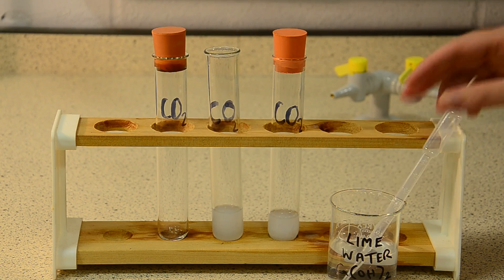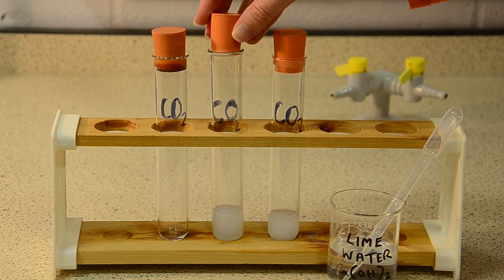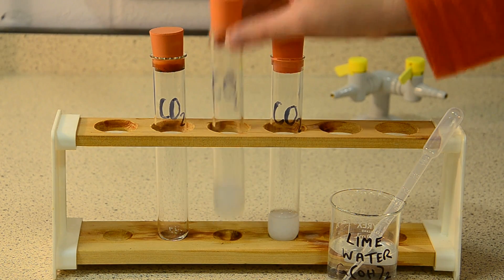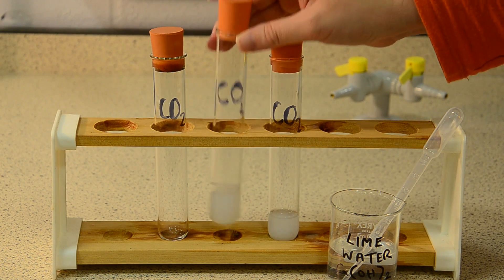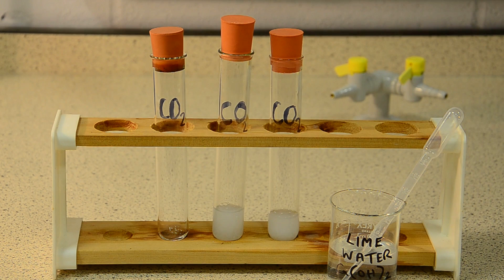The carbon dioxide reacts with the lime water to form a precipitate of calcium carbonate—that's chalk—and the standard answer in exams is to say that the lime water has gone milky or cloudy.